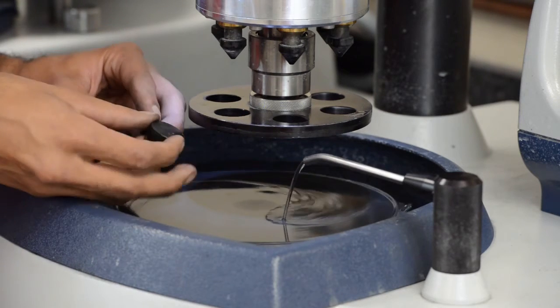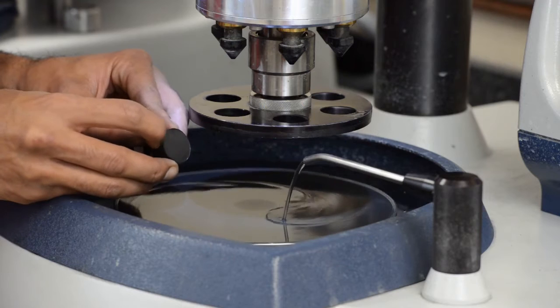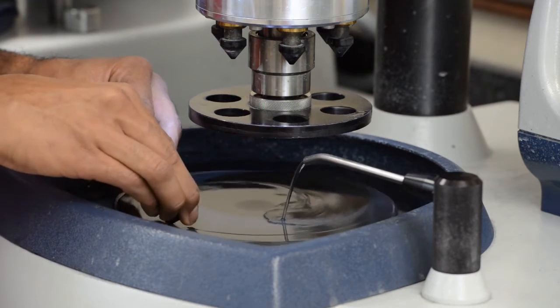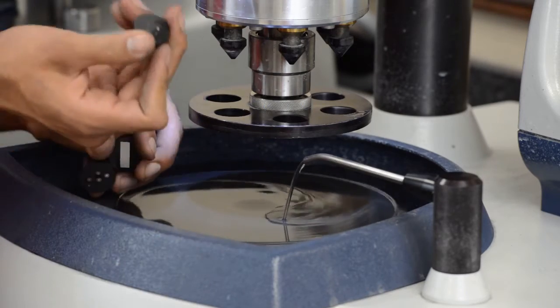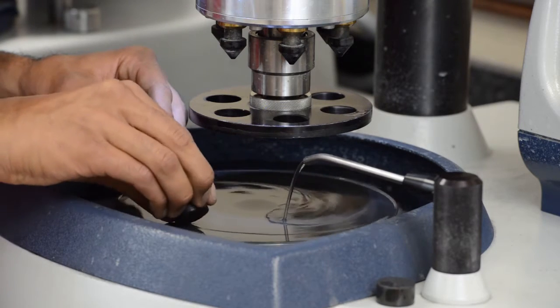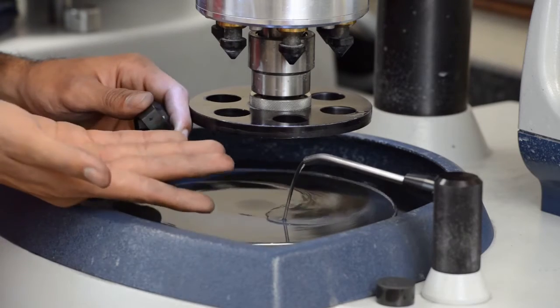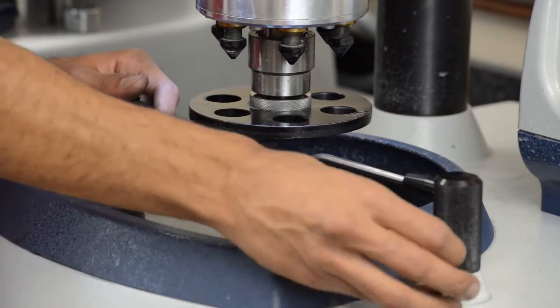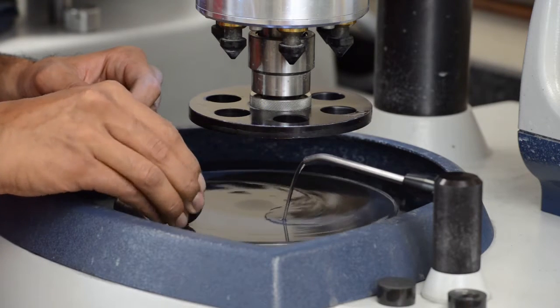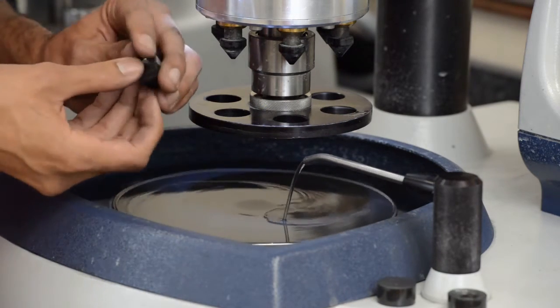What you end up with is a chamfered edge — so it's not such a sharp edge. Sometimes it's too sharp and it cuts into the sandpaper, which is annoying. I'll go ahead and do that at the back too because I don't want to get cut either. You can always use gloves if you don't want your hands to get as dirty. Alright, so these are ready to go to the next stage.